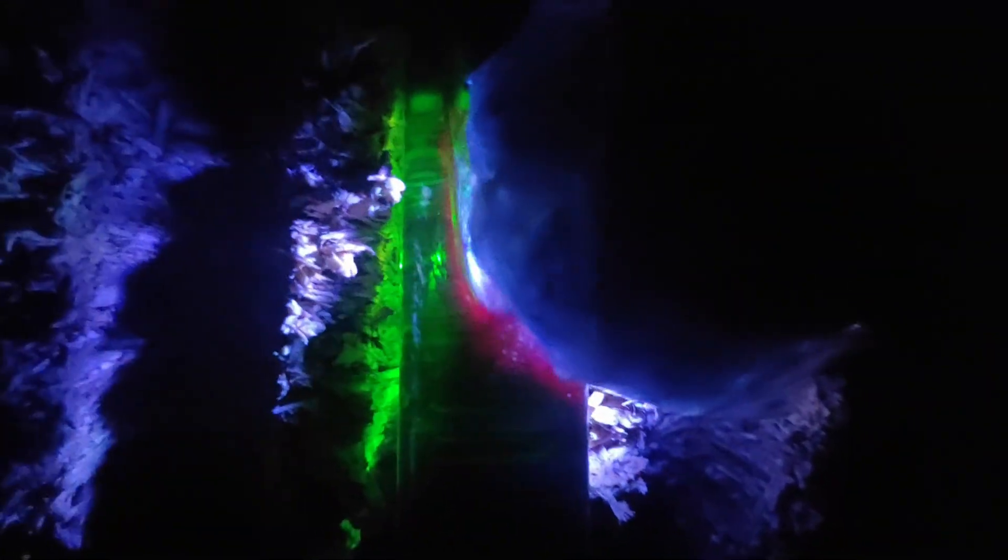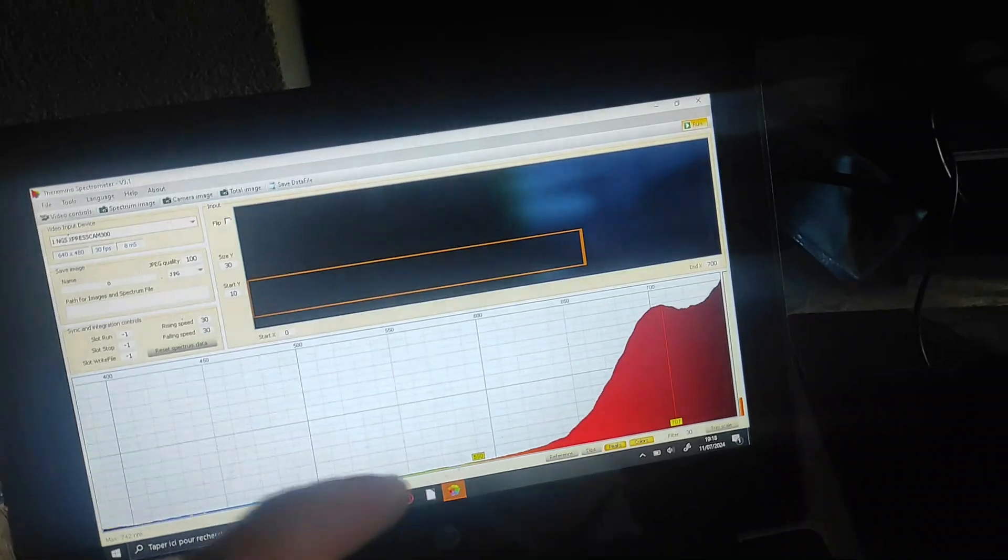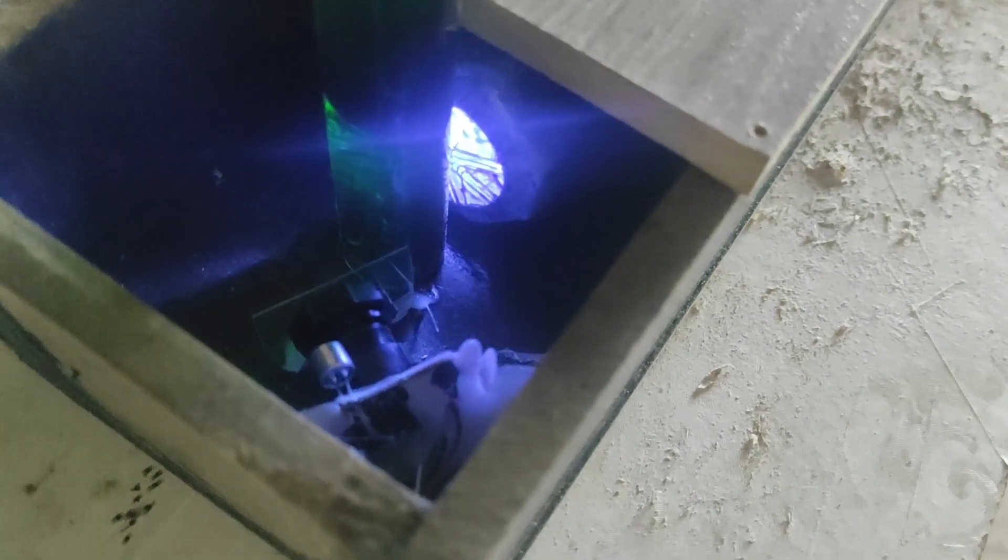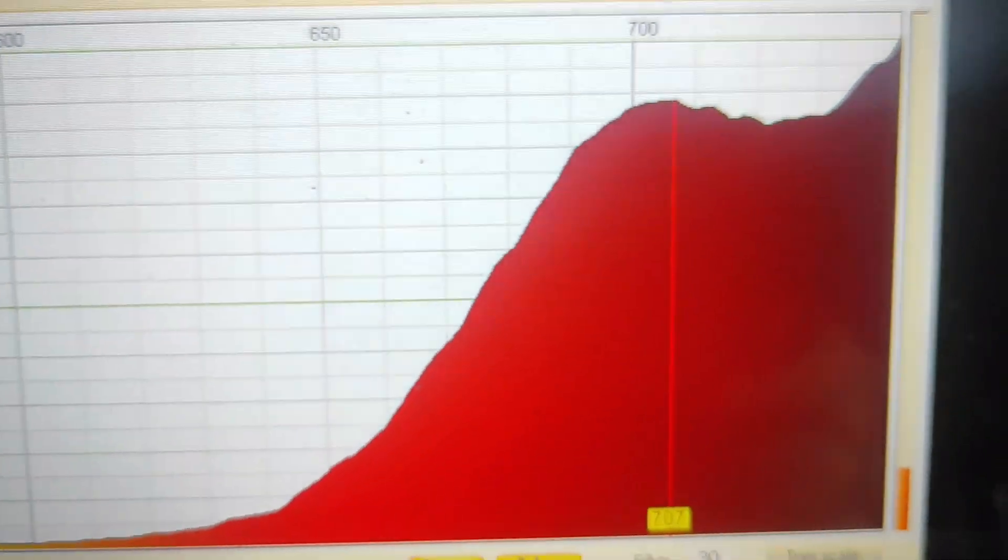Yep, so as you can see, it's very hard to get a good camera reading of this one, but I'm still going to try to get it right with the spectrometer. As expected, it was pretty hard to get a good reading, and I even had to put the blue light inside of the casing, but I think it could be much better by using a thin chlorophyll layer and a real UV lamp.